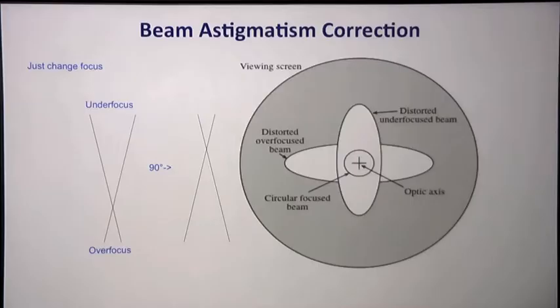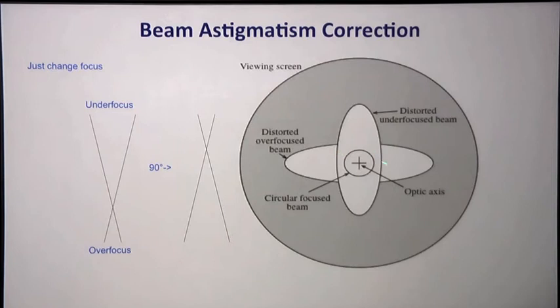So we also talk about stigmation in terms of electron beams. Ideally we have a nice round beam that will illuminate the sample uniformly. But if it's not round, oftentimes it's caused by stigmation. So one way to stigmate an electron beam is to change the focus of the beam with respect to the sample. And what you'll see is an ellipse on one side. You come through focus and it'll be a circle, and then it flips to an ellipse on the other side. This is exactly the same thing. You're looking at that stigmation going back and forth. So ideally, you use the stigmators to correct for this until you have a nice round beam going through the convergence point. This is another alignment that you'll do ad nauseam if you use electron microscopes a lot.